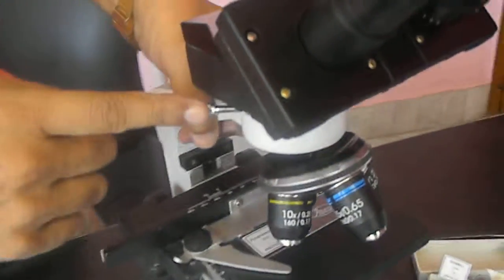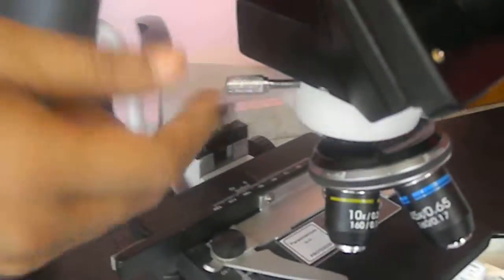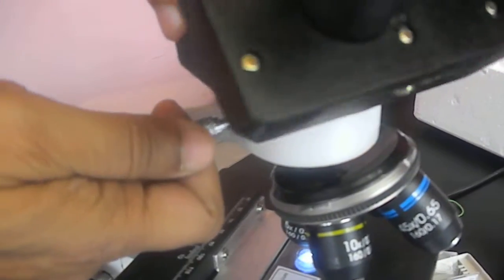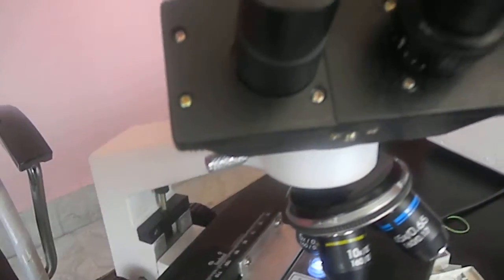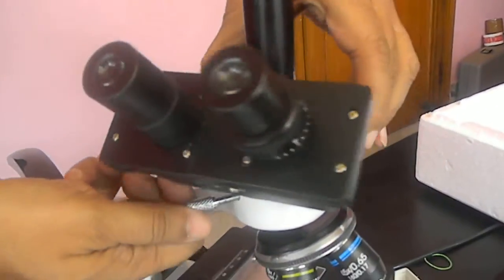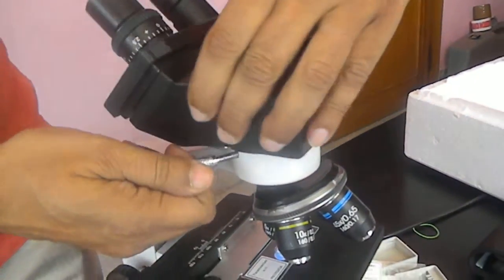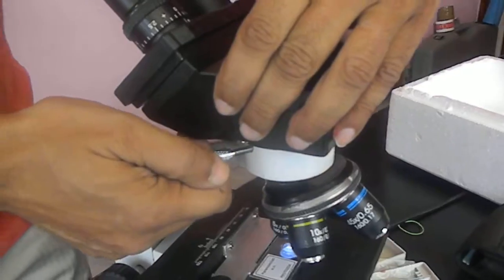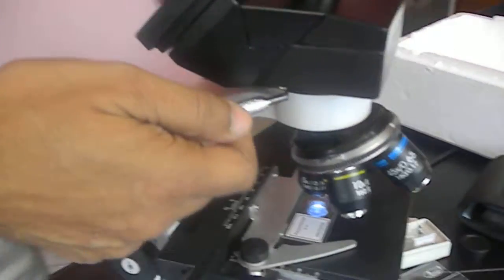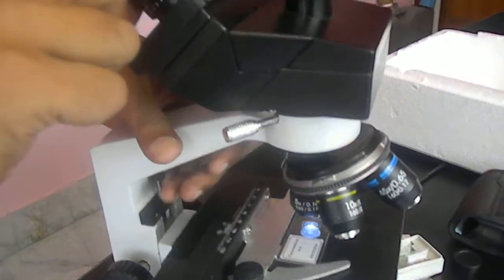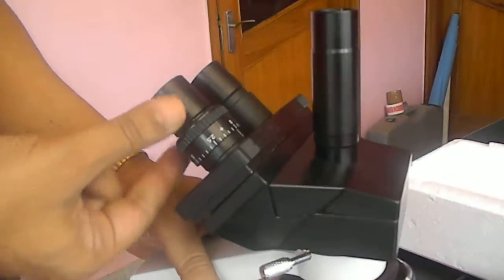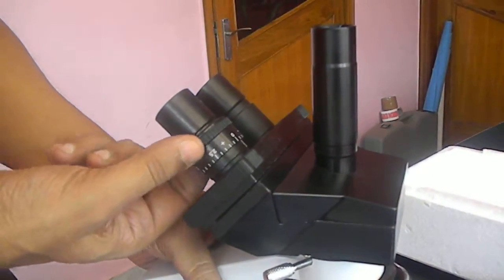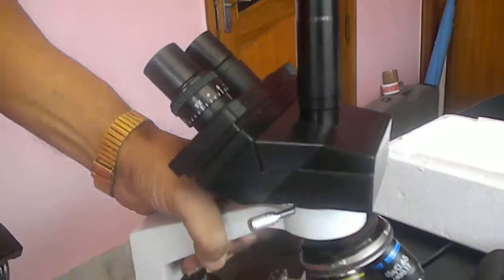Let us learn the microscope. It has a head which can be rotated from one side to the other side by this way and then you can rotate it. There is an eyepiece adjustment for the second eye and first eye.